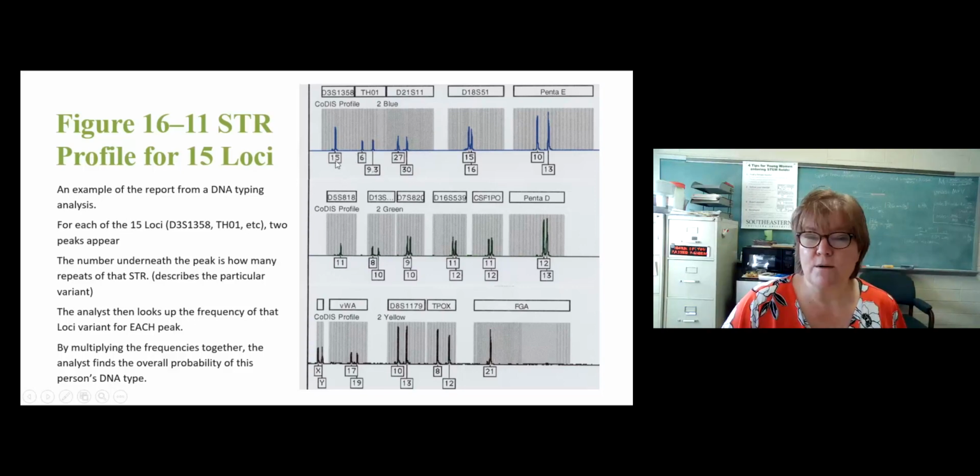The fact that there's only 1 peak here suggests that they had the same allele from both copies. Notice also it's like twice as tall. So that suggests that both their mom and their dad gave them the 15 allele, the one that repeats 15 times. And we go through and we have this overall version.